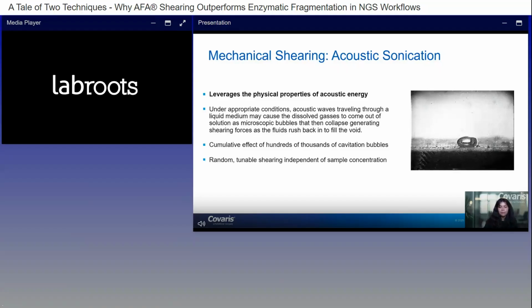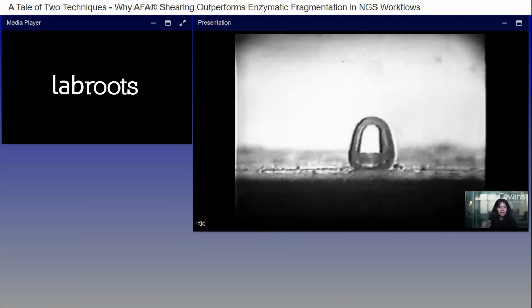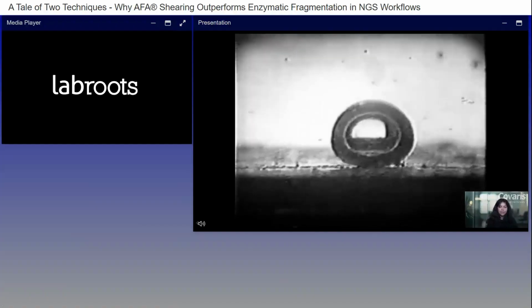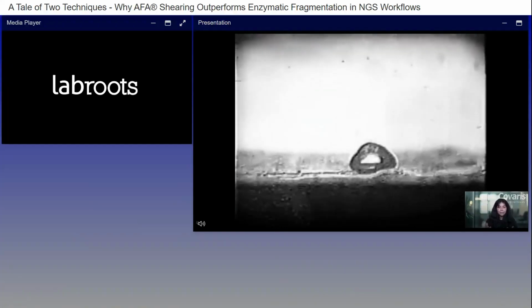So I'm going to show you a video here. And this video is just one cavitation bubble. But you can imagine that when you're sonicating your samples, it is the cumulative effect of hundreds and thousands of these bubbles that are processing your sample. So by manipulating acoustic energy, we can provide random tunable shearing that is independent of sample concentration.